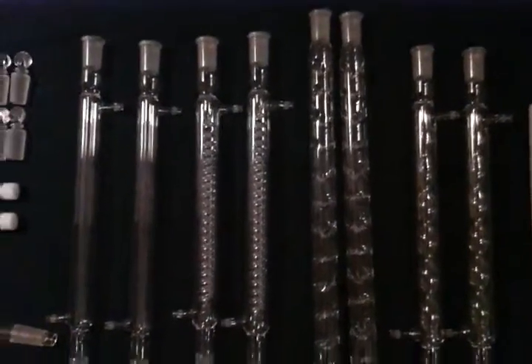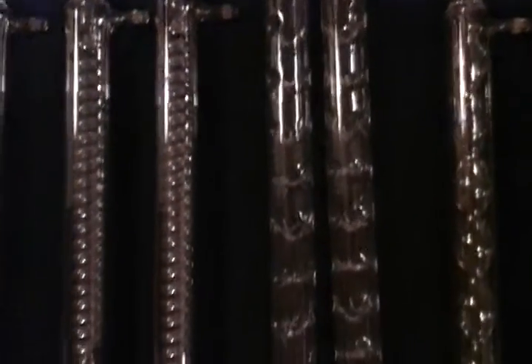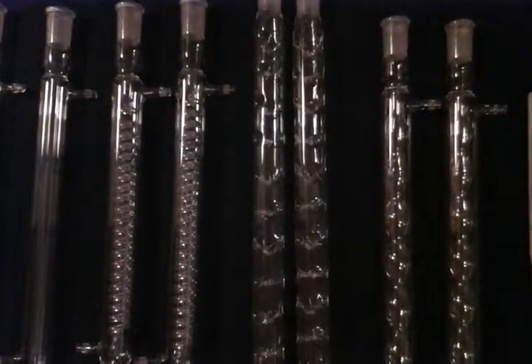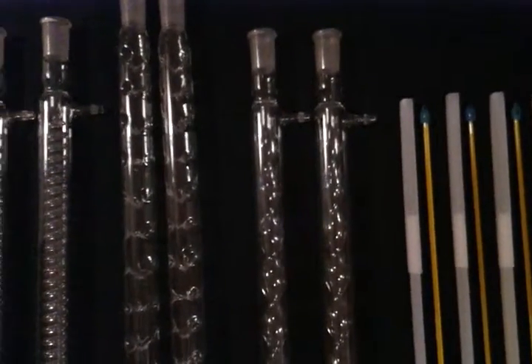This kit also comes with 8 condensers in 4 styles: 2 Liebig 300mm condensers, 2 Graham 24/40 300mm condensers, 2 Vigreux 400mm 24/40 condensers — 200mm longer than other standard kits, giving you 200mm more of an effective condensation surface area — and 2 24/40 Allihn condensers.